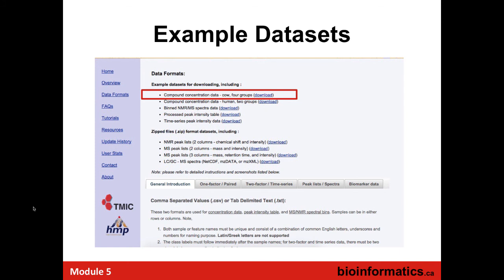And this has been really important, and this is something that you guys will use, hopefully. You can also use the data you generated yesterday, your own data if you want. But if you just want to get a feel for this, there's a whole range of example data sets coming from our lab that you can use, and you can download them. Some of them are in different styles or formats. Some will be compound concentrations. Some could be raw spectra. Some could be binned. Some could be whatever.